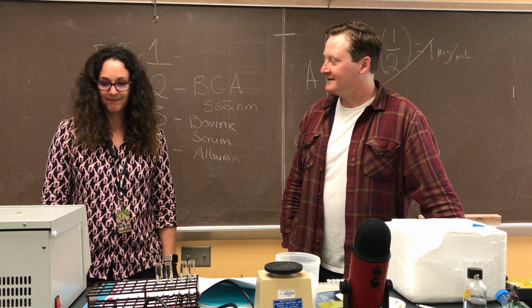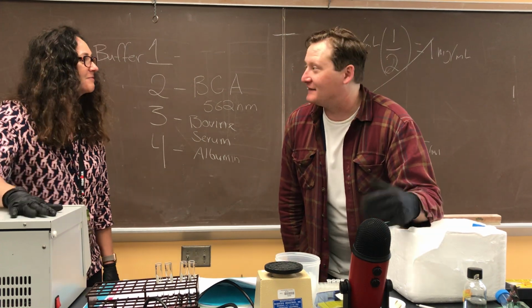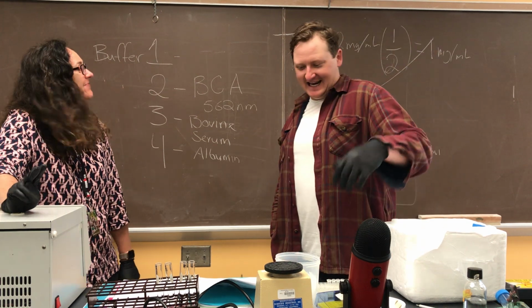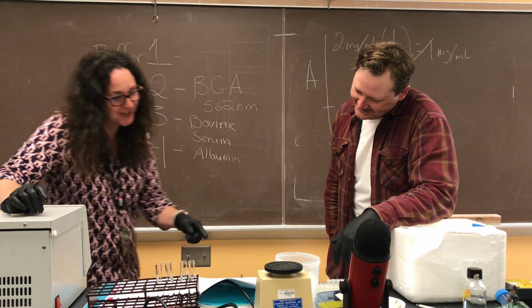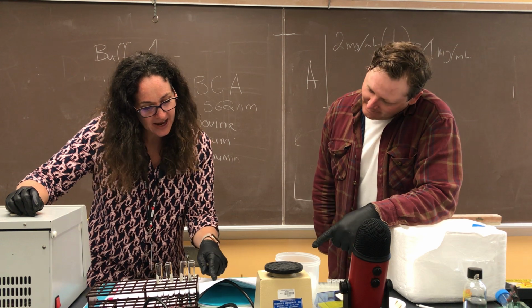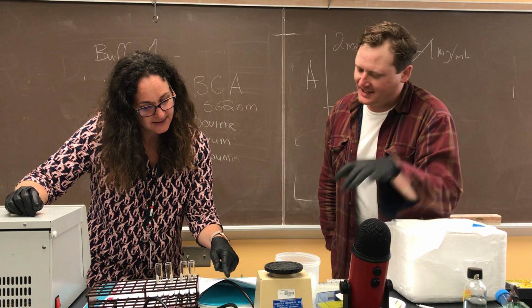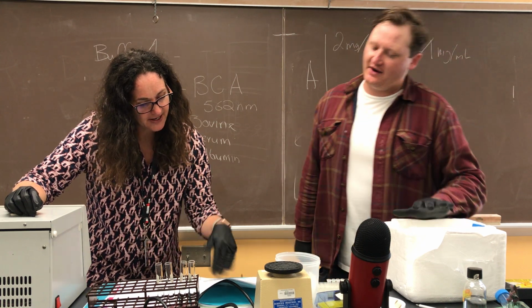Alright. So, I'll probably edit this part out of the video, but if I don't, we'll just be standing here, hanging out waiting for the centrifuge. So what do we do? Let's just look ahead. So we're going to add 200 microliters of the buffer, mix it on ice, then spin it in the centrifuge, then dilute it.